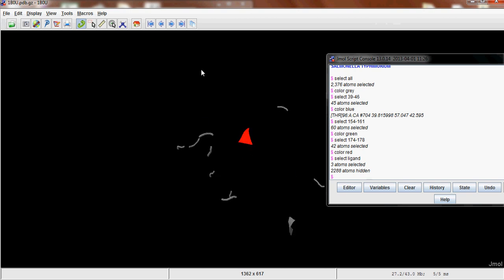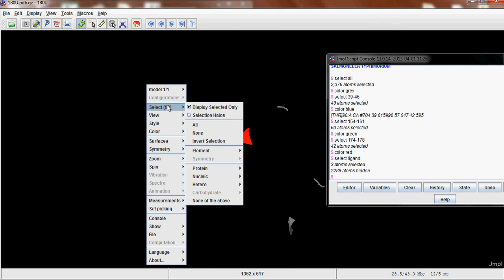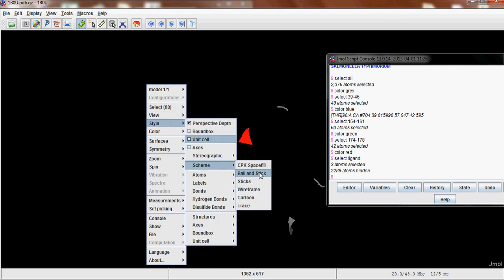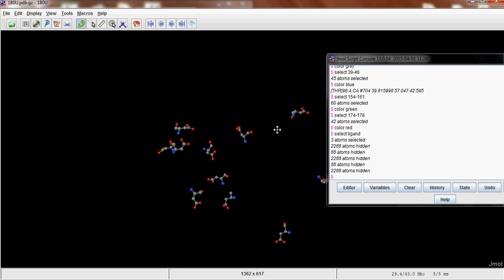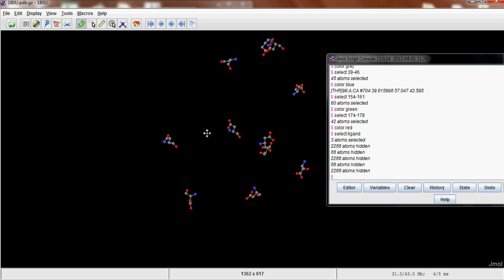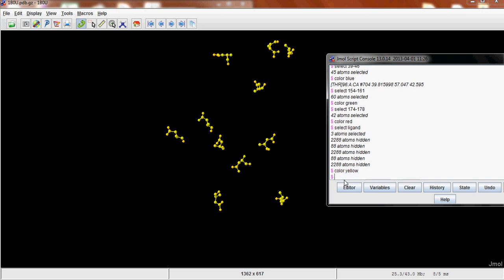So if you right click one more time, I'm sorry, this is a really buggy program, then you can go Style, Scheme, Ball and Stick. So now you'll get the atoms themselves in the amino acid. And you can give this any color you want. I'm going to give it yellow. So we can differentiate from everything else.